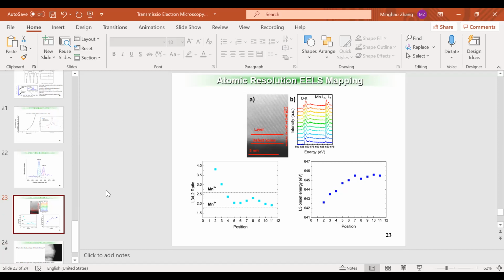Yeah, so if you want to do a real operando measurement, you have to consider the effect of the electric field through the biasing. But I don't think anybody knows how much we actually induce to the incident electrons. Okay, so in the operando measurement you're talking about, you would basically stop the biasing at the time you take your measurement and then resume it. Yeah, if you really worry about the coupling between your biasing current and the electrons, I think you have to do that, right? Okay, thank you.